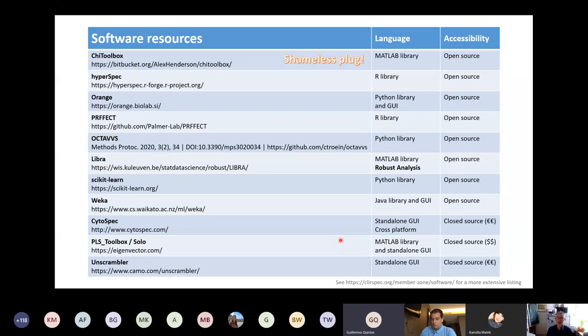Other software resources. We work in a software world, and I've put together some resources here. There are obviously many more out there, and I've tried to capture some of those in the ClearSpec software region of the member zone. They're in different languages. I've put together some here for different languages. So some have been mentioned already in this meeting. Orange will be covered this afternoon by Arto. Hyperspec, this is Claudia's toolbox in R.